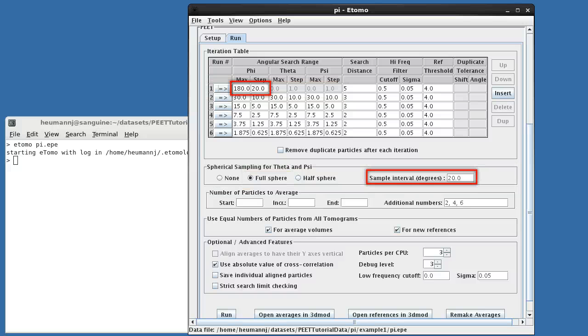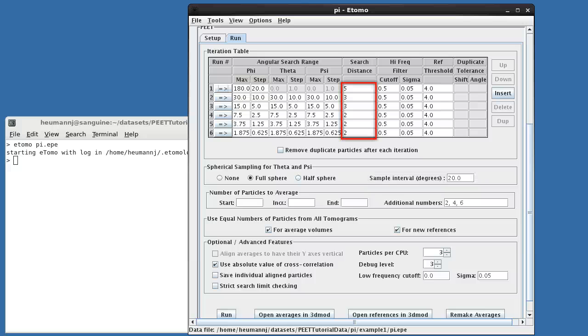The sample interval determines the equatorial spacing in psi and is typically set equal to the phi step, as we've done here. Search distance specifies the maximum translational shift in each dimension at a given iteration. Appropriate values are determined both by the structure in question and by possible modeling errors. Low-pass filtering can be used to minimize the impact of high-frequency noise on the alignment. Since these data are noise-free, we've disabled such filtering by setting the point at which high-frequency attenuation begins to the Nyquist frequency or one-half the sampling rate.